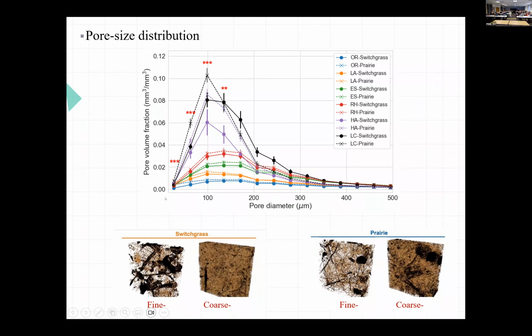This is our resolution, and you might think, well, that's a very strange looking pore size distribution that these people got. How come they have so few of these small pores? This is an artifact, because our resolution is 18, so we hardly see any real pores at that particular resolution. The next one, 50, is better, but it's probably also underestimated. At 100, definitely, we are certain about that.